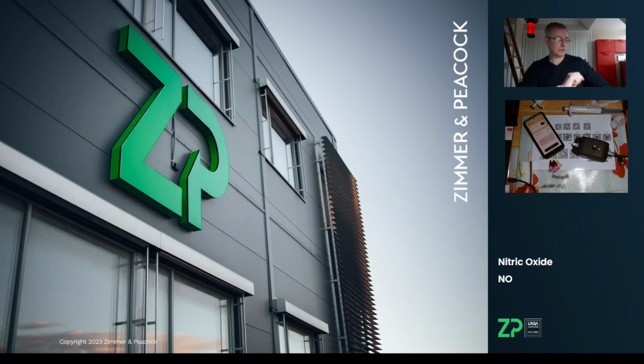Hi, this is a quick video just to demonstrate a nitric oxide sensor, what you can expect from a nitric oxide sensor from ZP. It's probably worth saying that what it will allow you to achieve is a scientific experiment. I want to be purposeful with that language and not talk about clinical, let's say, experiments.